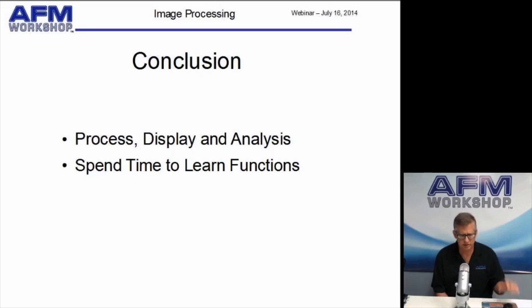Okay, do we have any questions? Okay, it says image contrast inverse in the nanoparticle image. Let me look into this. I guess maybe the color scale looked backwards on that, where maybe the particles looked like they were going into the surface. So we'll go back and review that after we do the presentation.